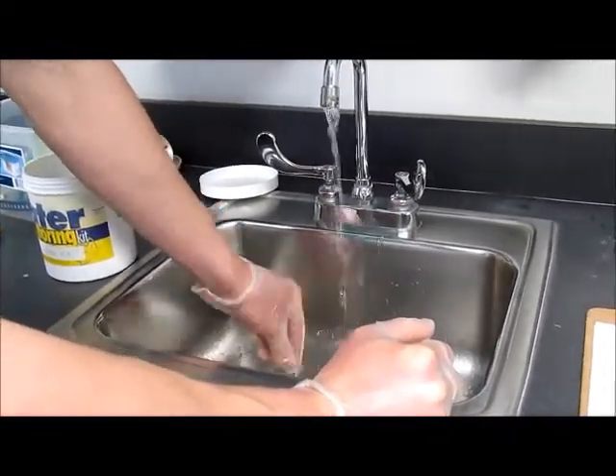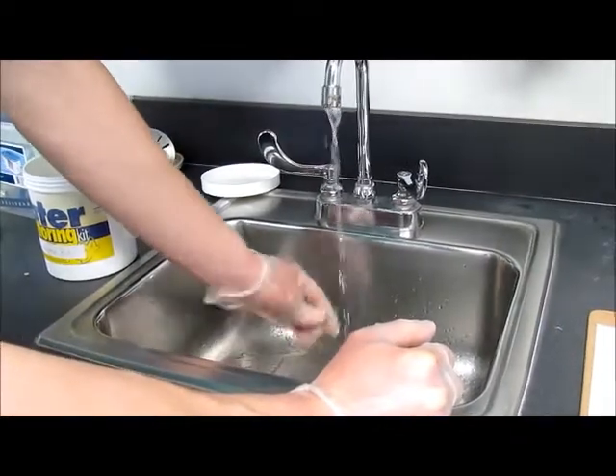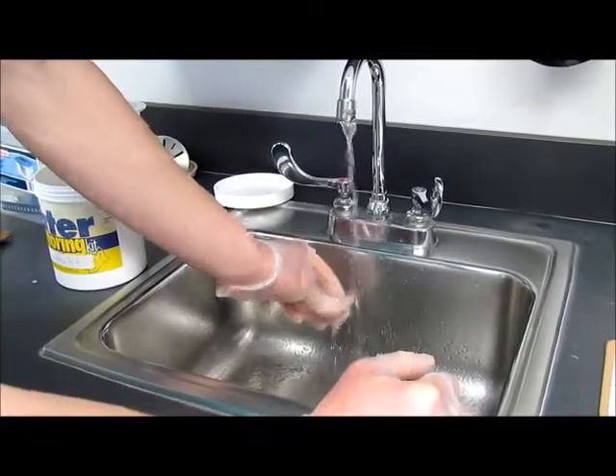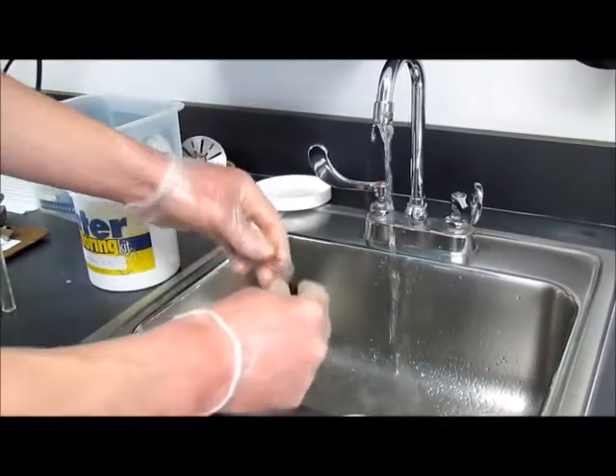Rinse each one out several times and make sure it's thoroughly clean. After you've rinsed it out, it is safe to use for your next survey.